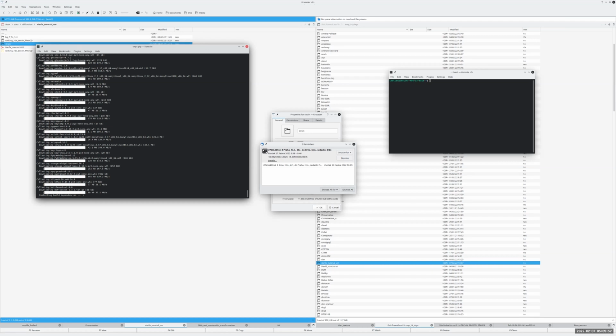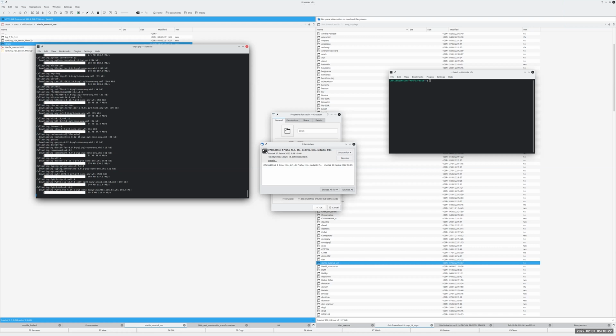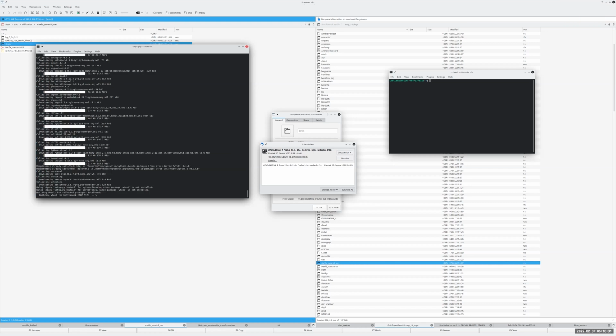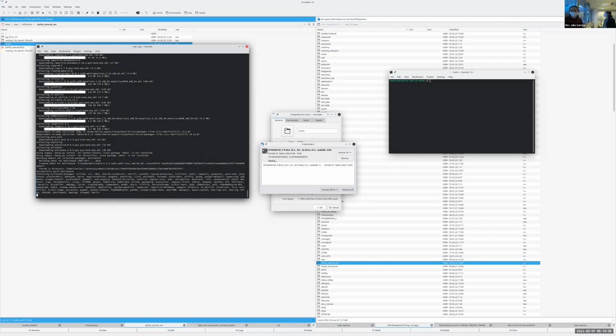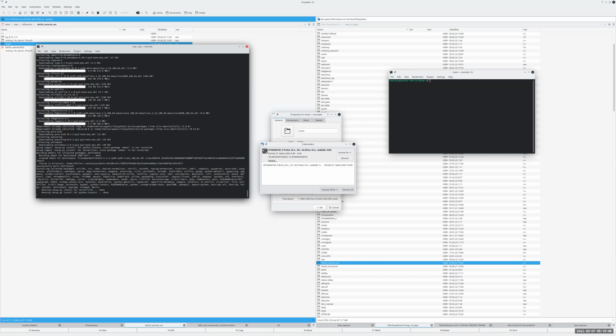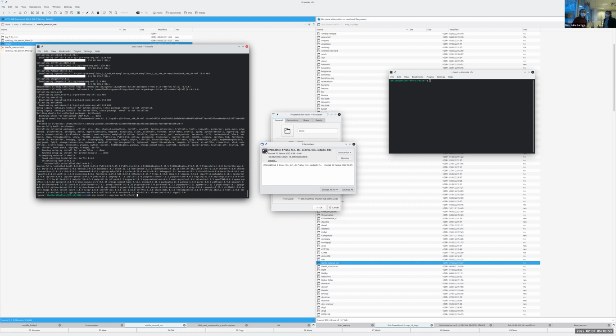And maybe now, in the meanwhile, can you explain to us this Orange canvas? Is this some kind of environment that you are just using for this data processing, or was it also developed at the ESRF? No, it's not developed at the ESRF, but we use it to show the workflows basically. We create the widgets, and with Orange we link them, like you saw in the presentation. So it's easier for us to create a graphical user interface. It looks good. If you don't want to use the graphical user interface, you can just take the widgets from Julia's page in Git and use them in a Jupyter notebook. So it's not needed to use the graphical interface, but you can use it also.